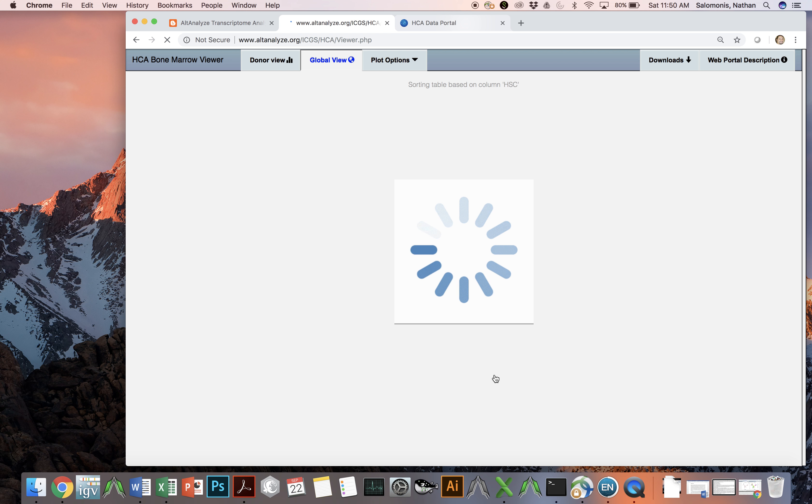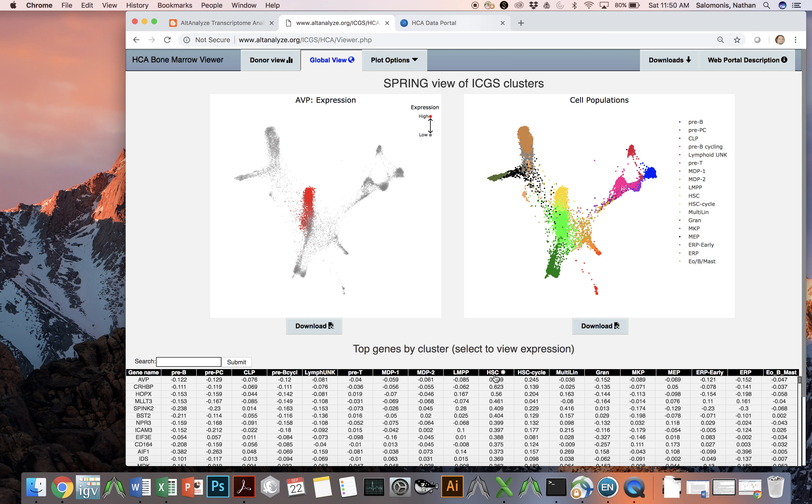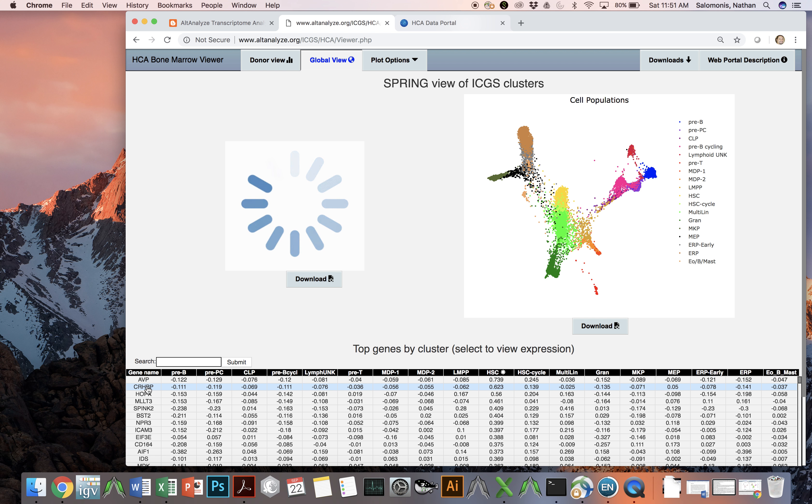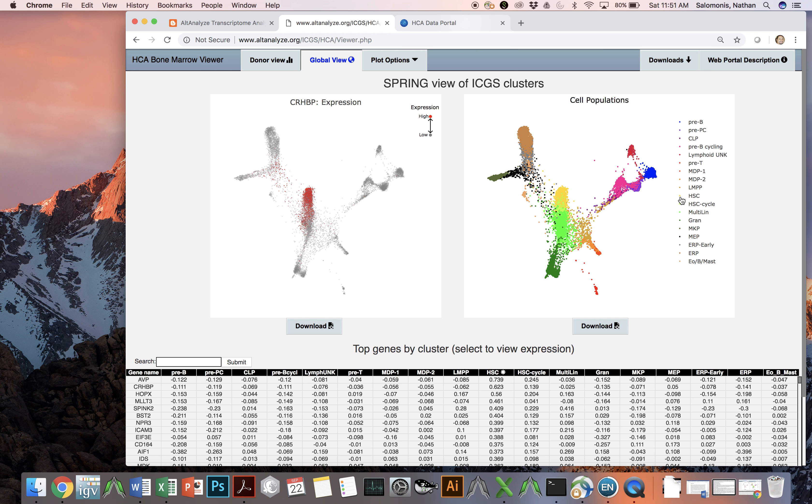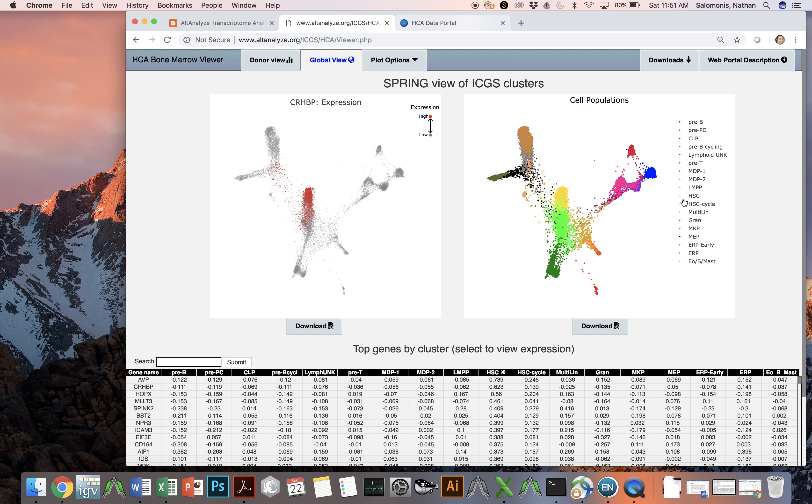In this case, we clicked on HSC, so we're identifying genes that are most specific to hematopoietic stem cells. In this case, the gene AVP was most specific. Second ranked was a gene called CRHBP, and you can quickly view what the predominant cells that express that gene are within this dataset. You can actually select each one of these different cell populations, for example HSCs, and you can hide that population or view it again to clarify where it is within this layout. This layout was generated by a tool called Spring from Alon Klein's group.